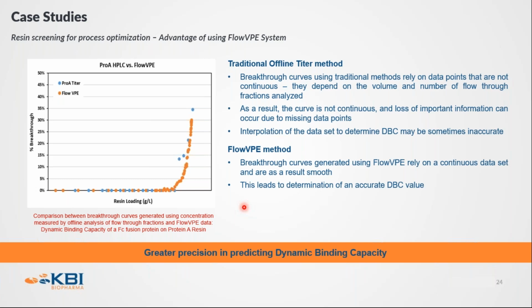And also for UFDF, and for the dilution step in the drug product suite, where they would use it to decide when to stop the dilution when they've reached the final concentration.